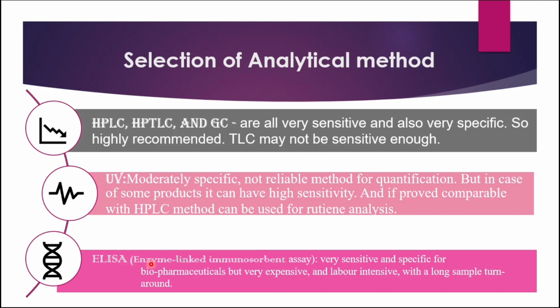ELISA, enzyme linked immunosorbent assay method. This method is very sensitive and very specific. It is used for biopharmaceuticals, but this method is very expensive and labor intensive as well because of its long sample turnaround time.